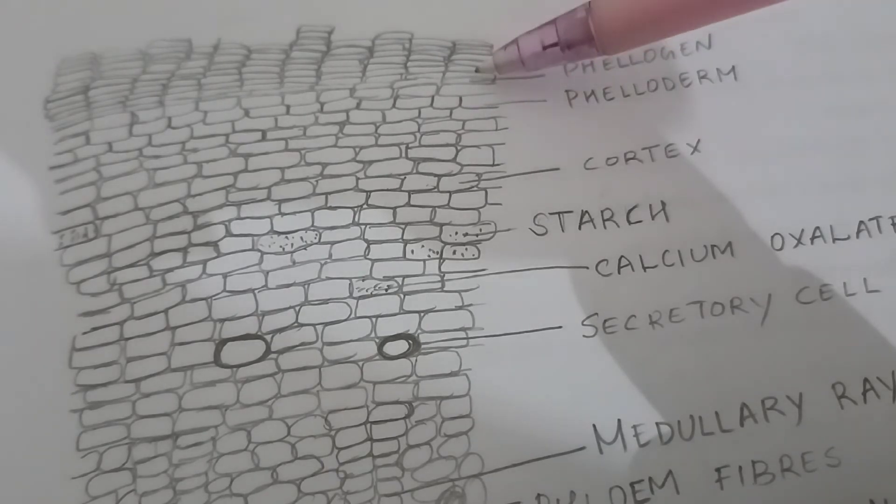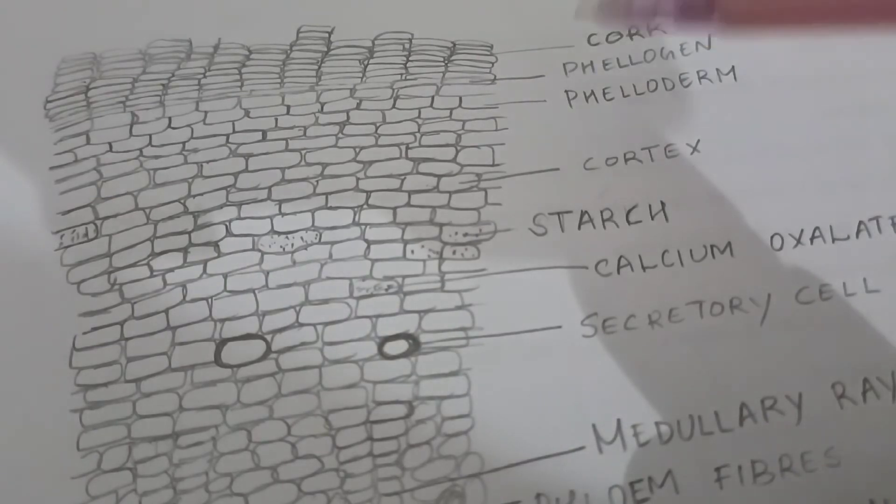Below that we can see 2-3 layers of thin-walled cells without any cellular content. It is called phelogen. They are rectangular cells.